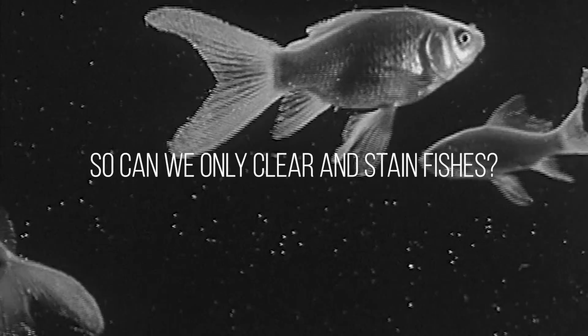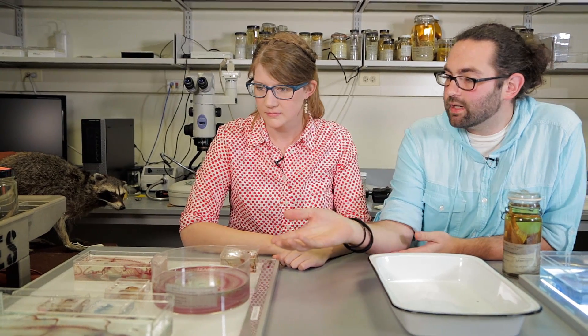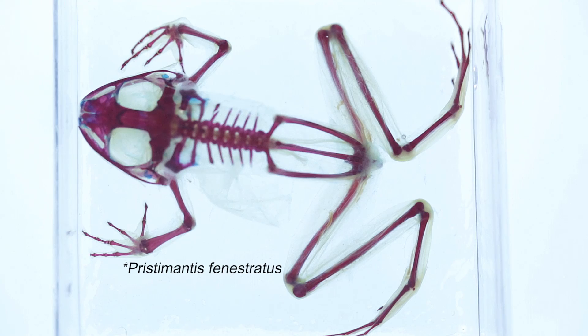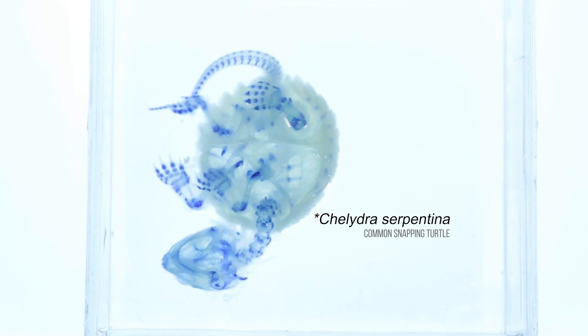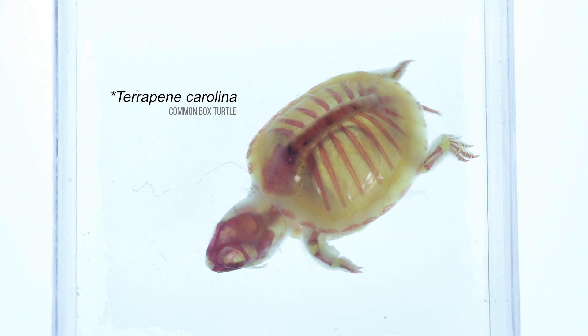Are fish the only thing you clear and stain? They're not the only thing. We also have examples from other vertebrate groups. These are amphibians and reptiles. Here we have a snake — you can very nicely see the vertebral column wrapped up. There's a frog. And the turtles are interesting: the blue one has a cartilaginous skeleton, so that's an embryonic turtle — a baby, baby turtle. Then this smaller turtle with the red skeleton is actually a small adult species.